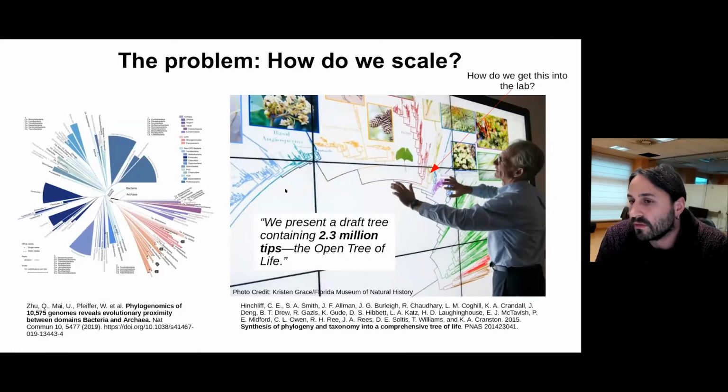This model has been working very well for us, working on tree analysis and visualization in the lab for analytical purposes. So we are visualizing trees all the time on a daily basis, and this system is working quite well in general. The problem is that the data sets that we are starting to deal with in the genomics area are huge.